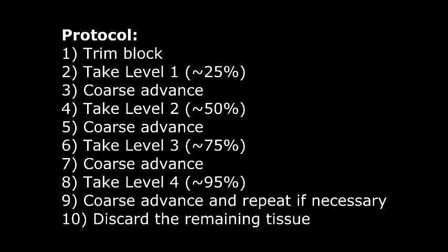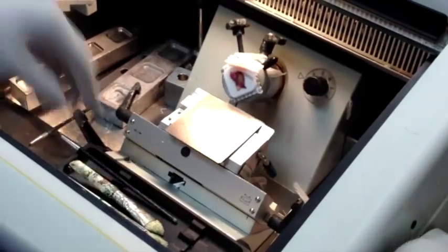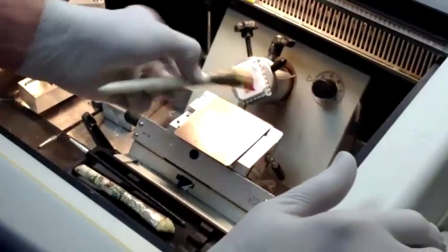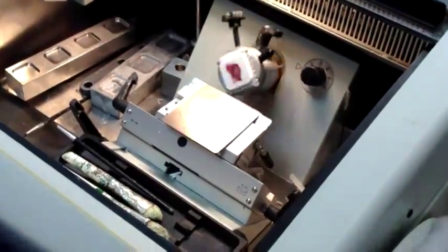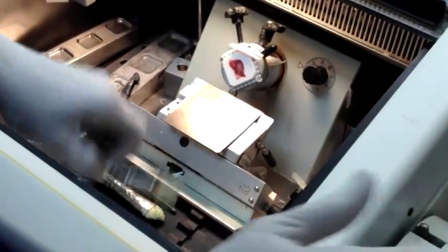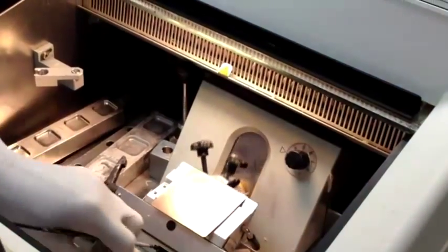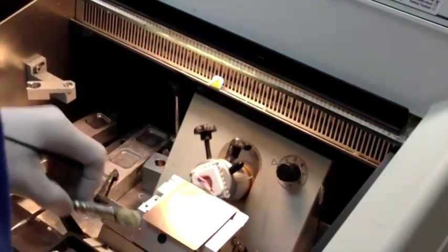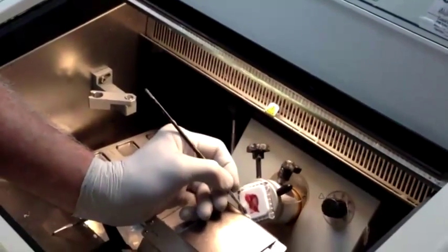I'm going to rough cut into this thing to get down about 50% of the way in — and these are estimates, right? So I've cut, and I'm going to say a little farther. I'm going to say this is 50% of the way in. These estimates you make pretty much through experience.